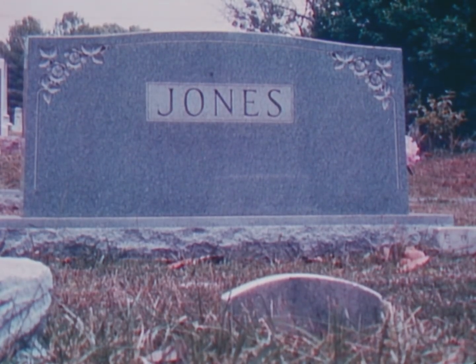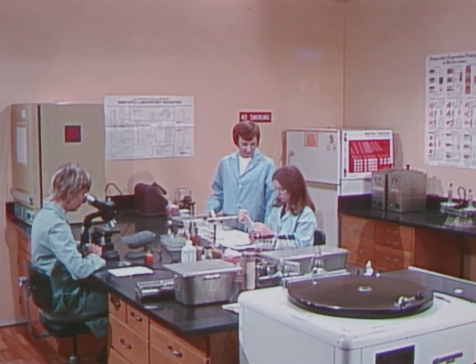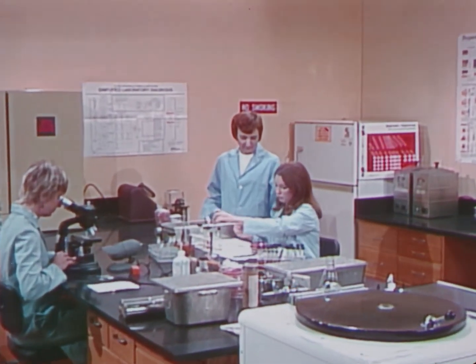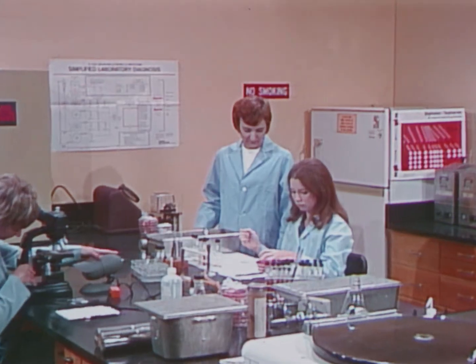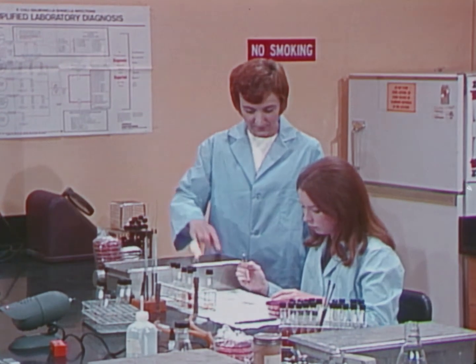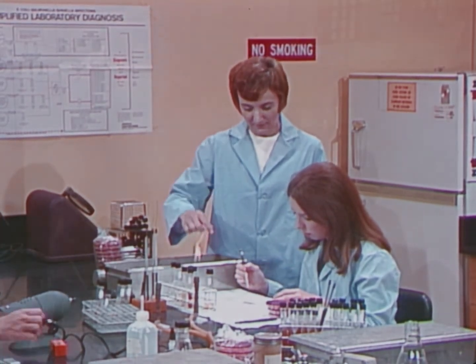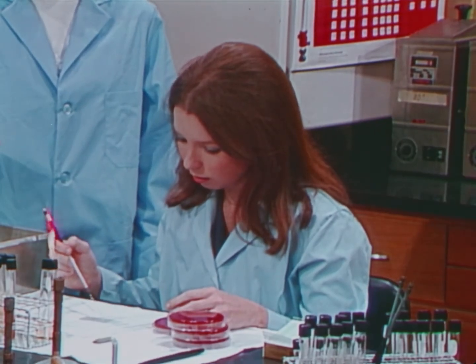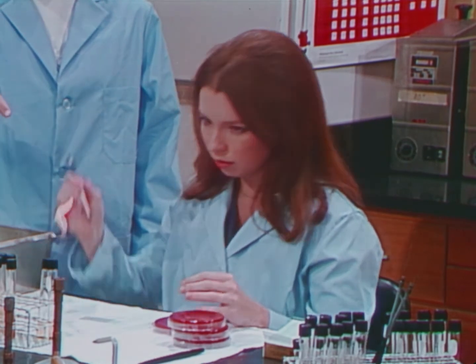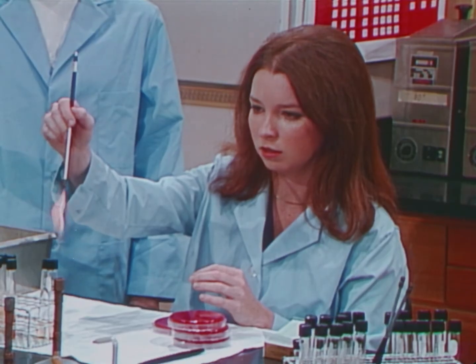The majority of the laboratory infections occurred at institutions engaged in research or clinical diagnostic work. The people involved were primarily trained professionals, people most knowledgeable about laboratory hazards. The meaning is clear. Infectious hazards can only be reduced by carefully following appropriate procedures. This presentation has been prepared to provide the knowledge you need to reduce biological hazards in the laboratory.